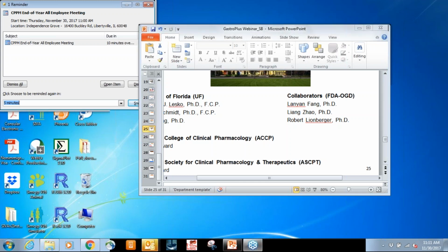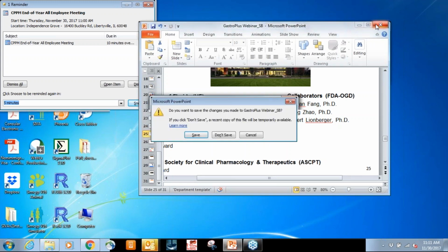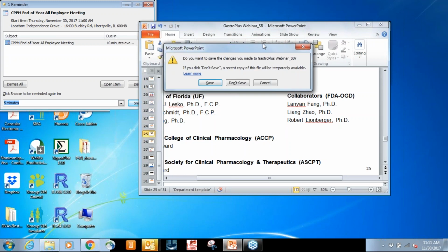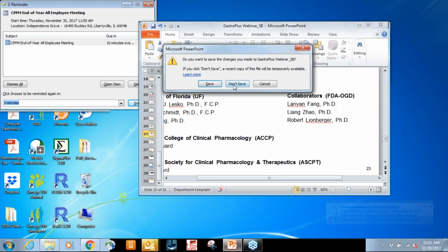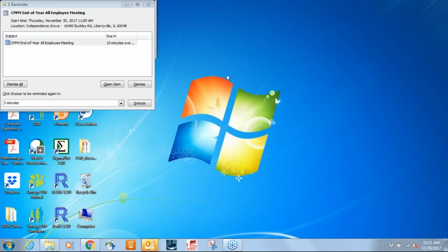We also have a model for long-acting injectable formulations that we're adding to DDDPlus based on an FDA grant we've been working on. These are for PLGA type formulations. So there are a couple of things that can be done, and there are some new things coming down the pike.